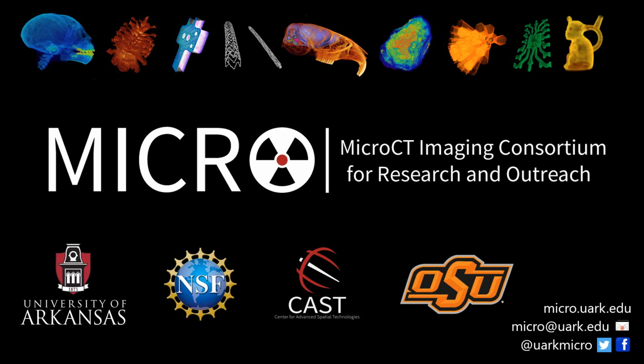Hi, my name is Claire Terhune, and I'm here to give you a brief intro to the MicroCT Imaging Consortium for Research and Outreach, or MICRO for short, at the University of Arkansas. This facility is funded by the National Science Foundation and supported by the Center for Advanced Spatial Technologies at the University of Arkansas and the Oklahoma State University Center for Health Sciences. I'm also going to provide a brief overview of how CT imaging works and some of the equipment specifications we have here at MICRO.